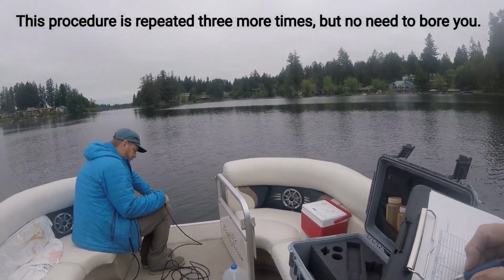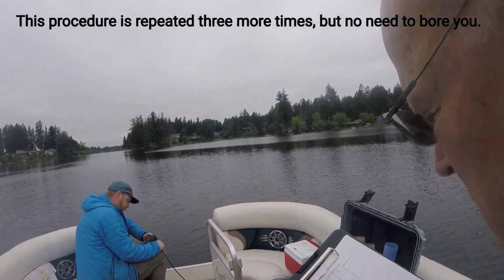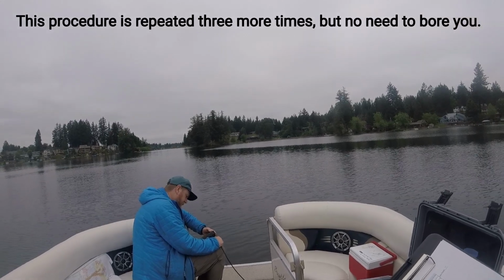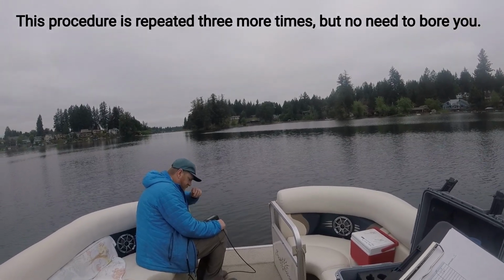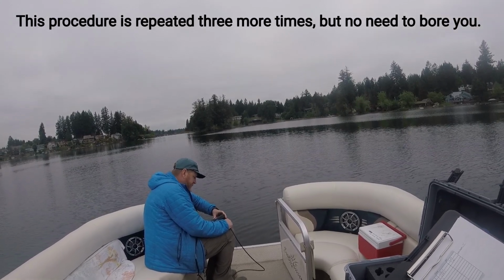So are you going to do this at every meter? Yep. So they're recording this information of temperature, dissolved oxygen, conductivity, and pH at every meter down to the bottom, which would be about 14 feet.